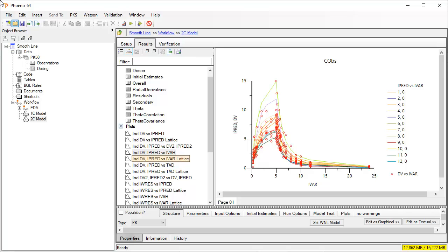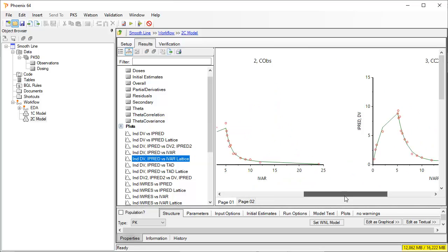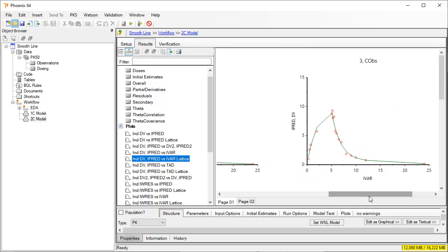This can also be seen in latticed plots. This type of Phoenix plots connect the predicted concentrations with a straight line at the times observed.